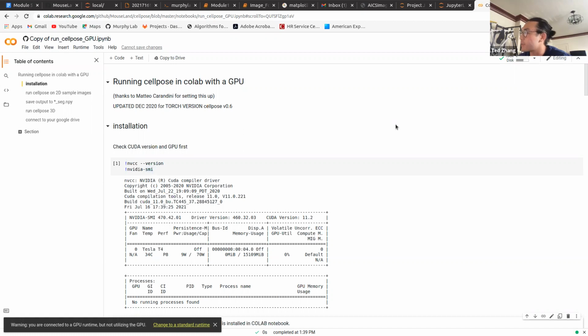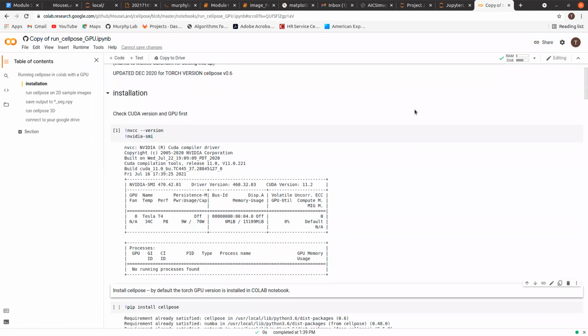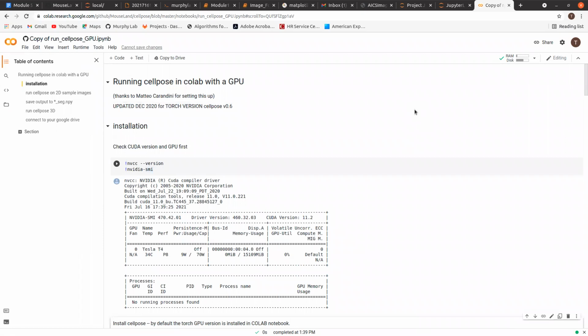I use it a lot, but for the segmentation, I don't use it. I can make TIFF files maybe. Are those okay? Yeah, that's fine. I don't know if they will work. It's MATLAB based segmentation, and it produces this dot model, and I tried to convert it to TIFF. It did something. I don't know if it's correct. But that's how far I got with that.